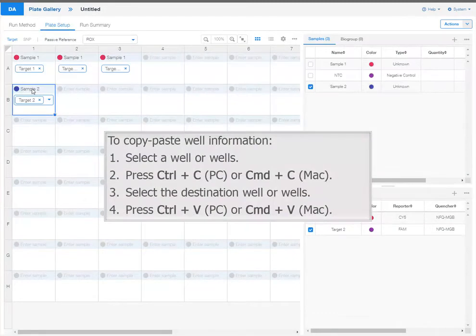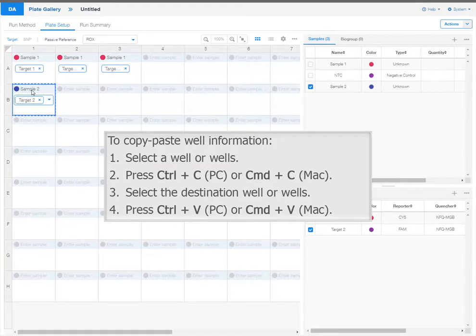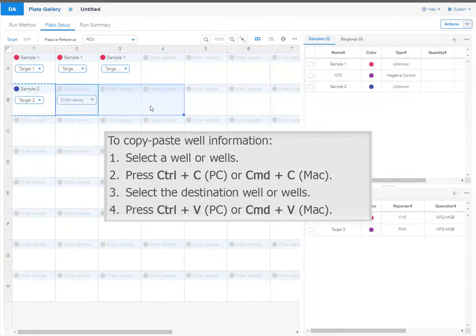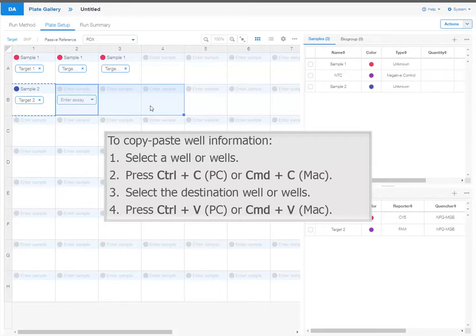To copy paste well information, select a well or wells, then press Ctrl C or Command C to copy. Select the destination well or wells, then press Ctrl V or Command V to paste.